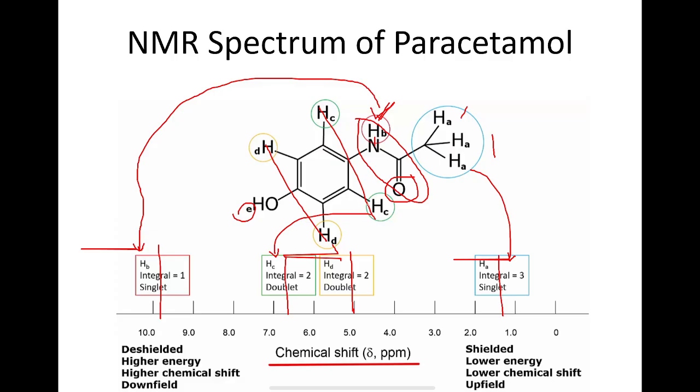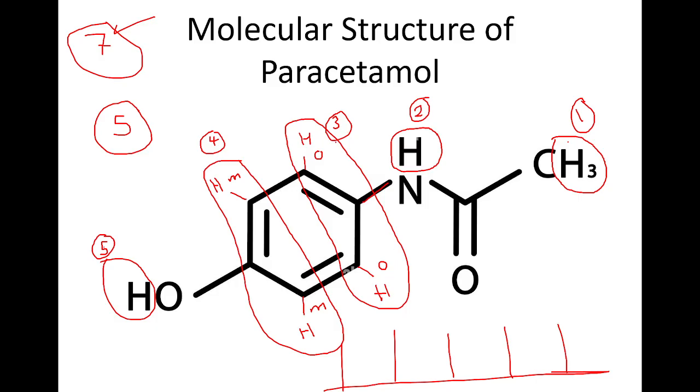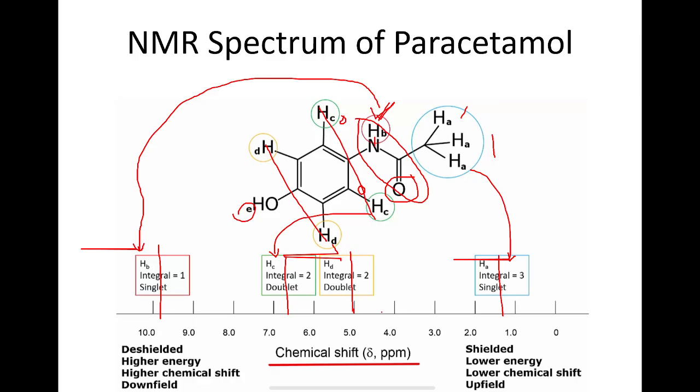So this hydrogen compared to this group is ortho, right? And this hydrogen is ortho. If we go back to here, you see that's ortho to this group. These two hydrogens are meta to this group. Therefore, the effect of this group on these hydrogens is higher. Therefore, these two hydrogens, the green ones, are more de-shielded. Therefore, they are more downfield.